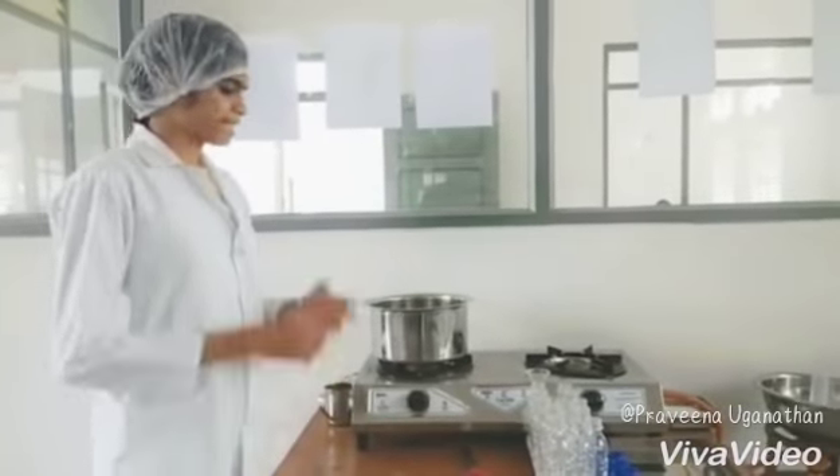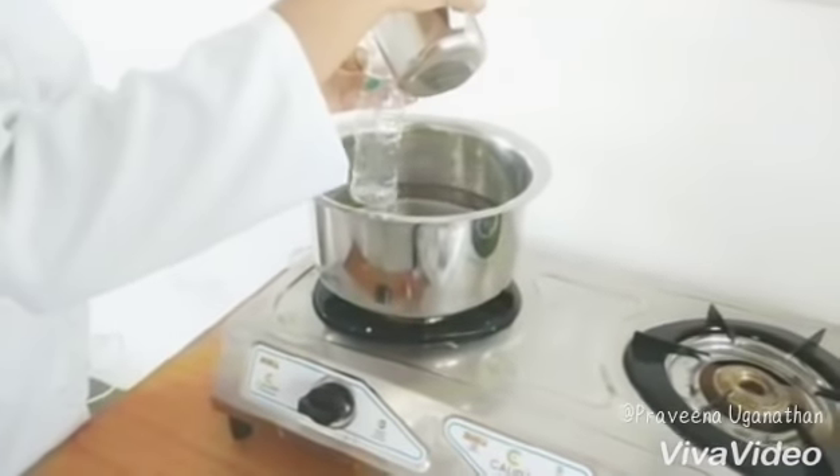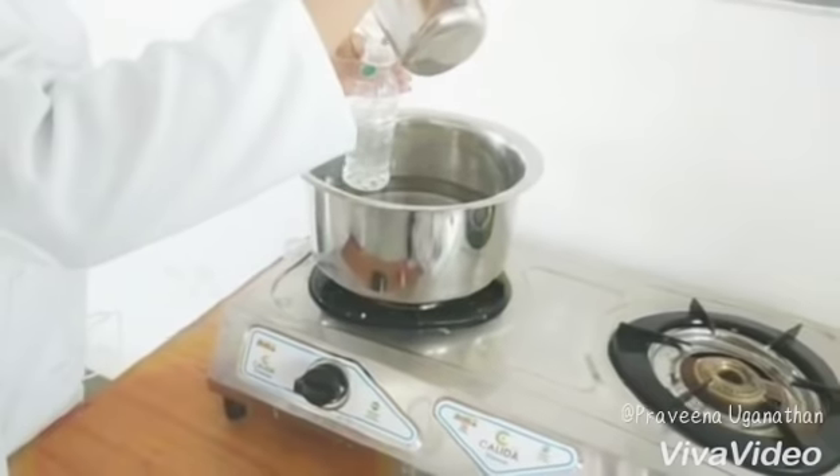Sterilization: Heat the distilled water to about 70 degrees Celsius and fill it in the pet bottles. See to it that the water is filled up to the neck of the bottle.